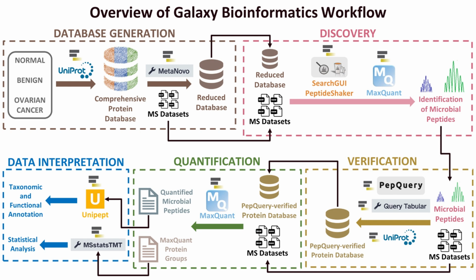I will summarize the modules here, but keep in mind that each has its own dedicated video. Starting from the top left corner and going clockwise, the order of the modules is as follows: database generation, discovery, verification, quantification, and data interpretation.